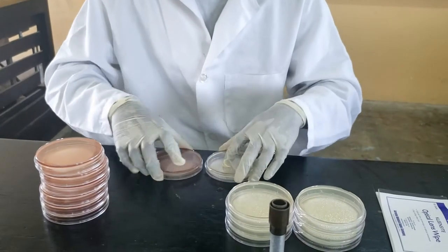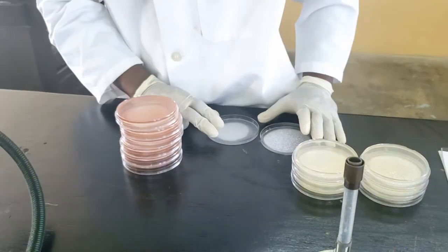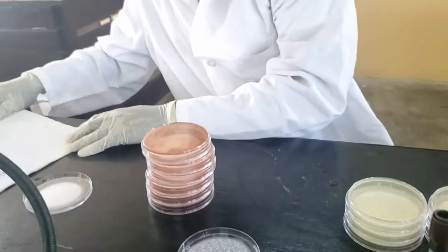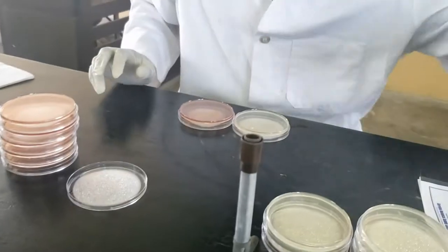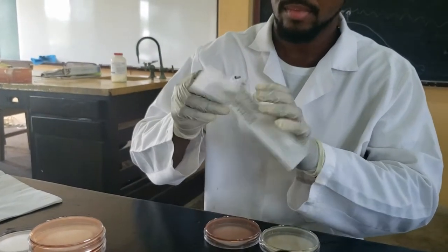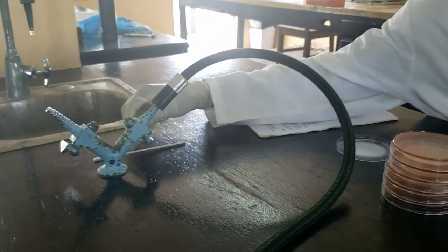So the first two plates we'll just open on the lab table here, and leave those exposed for 30 minutes. It says the next two, we're going to use cotton swabs and we're going to sample an area on the desk. So we have some sterile cotton swabs here. Let's just do a random area on the desk. Let's do near the sink.